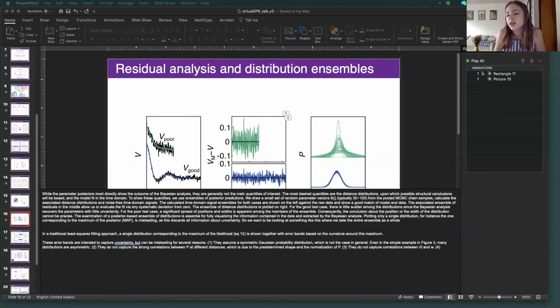Again, you would have to test with several models and try to see which is the best fit, but a Gaussian method might not be the most appropriate. The nice thing about this specific method is that it's really easy to change the basis function we're using. So you don't have to use a Gaussian mixture model. That's just what we chose to exemplify the work, but you could easily use a Rice distribution or something else. And then ultimately, we hope to apply this Bayesian method to non-parametric models, in which case you wouldn't need to assume any specific shape of the distribution.